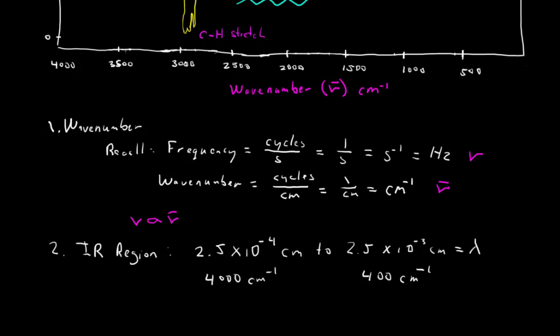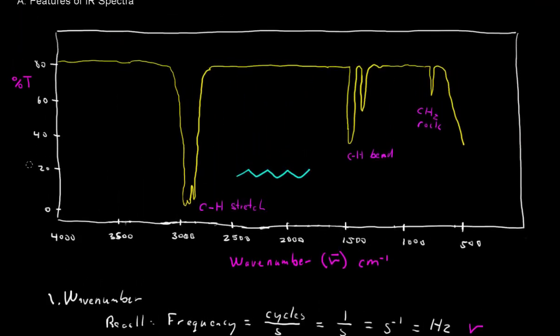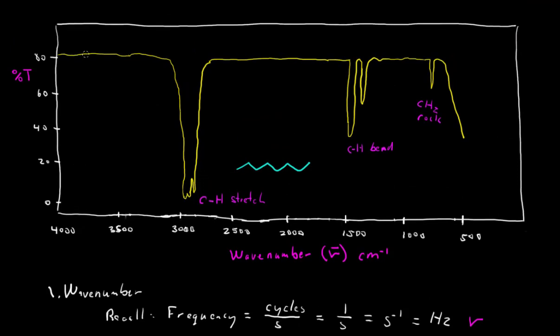So now let's briefly look at the simple spectrum of octane. As I mentioned a moment ago, our CH stretch is at fairly high frequency because we've got these very small hydrogen atoms. And we don't see much else in the spectrum. Way down here below 1500, we're seeing CH bending frequencies, and note those aren't as strong. The bends aren't as strong as the stretching frequencies. And there's a rocking CH2 methylene frequency down around 600 reciprocal centimeters.